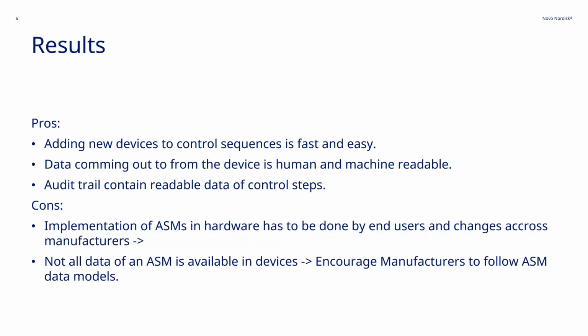Then the next thing is that every time you see the response that you get from each of the individual instruments, you can read it. So you can use it either for troubleshooting, but you can also mass store it and then do something smart with it later.